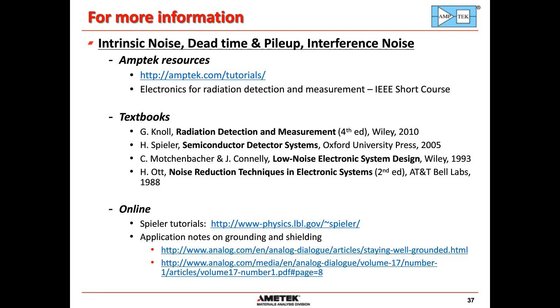One of the questions that was asked is about why the pulse height centroid shifts with the detector temperature. That's a good question, and there's really three things that affect that. Most inherently, it's pretty well known that it takes about 3.6 eV to produce one electron hole pair in silicon. So that's the energy per pair. What's not as well known is that value is actually a pretty strong function of temperature.